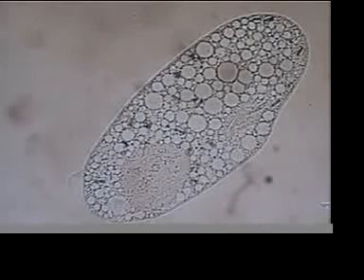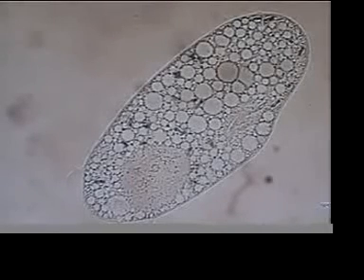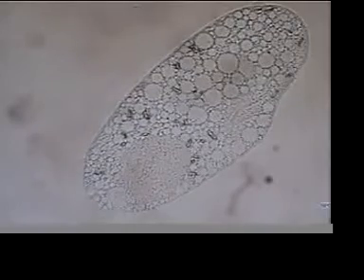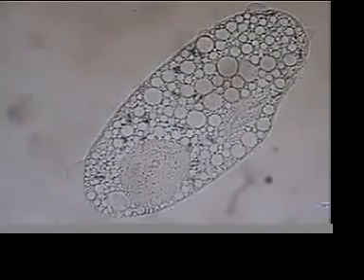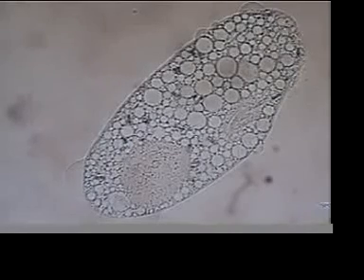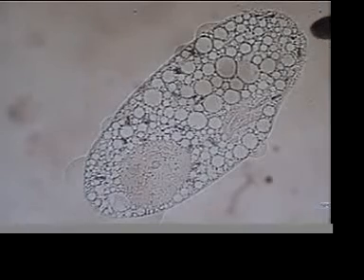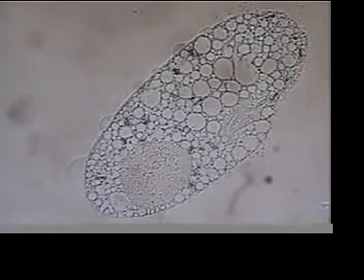This is a paramecium, and if you look carefully, you'll see there's some blisters in the bottom. Let me move them up just a little bit so you can see that. Another two more new blisters just formed on top. Here, and here's two blisters, and something just broke here. Oh, I believe he just exploded.